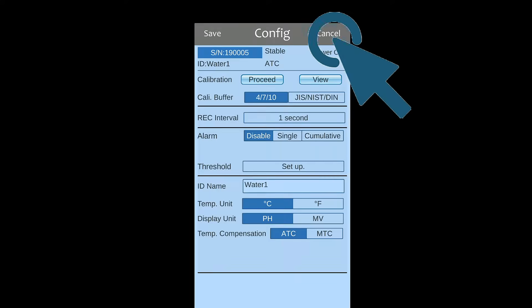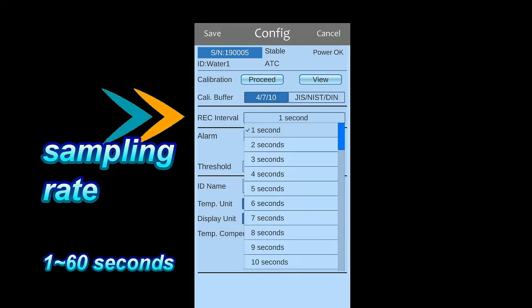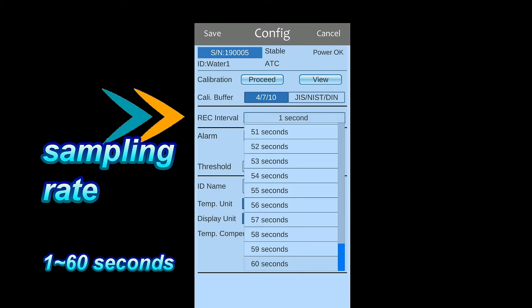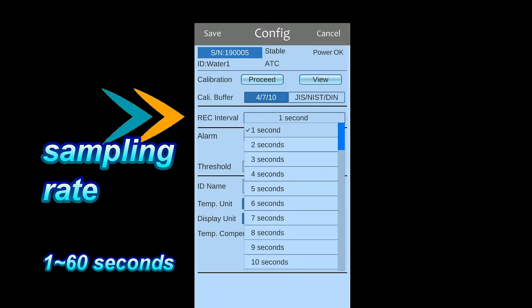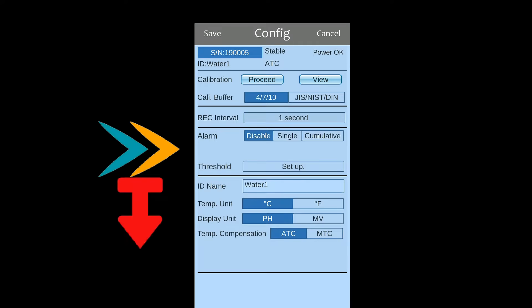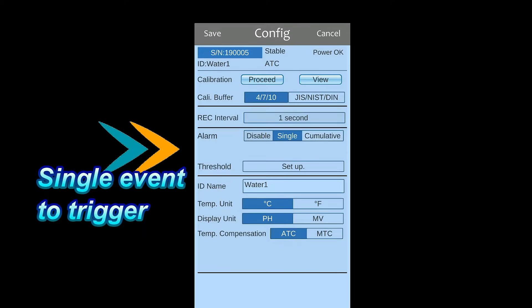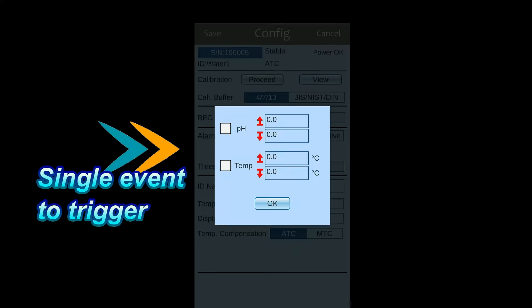Press setting button for general setting. Before recording measured value, it is a must to set up sampling rate. You may also activate alarm to get sound and vibration alert on app. Alarm can be triggered when single event or cumulative events is appeared.